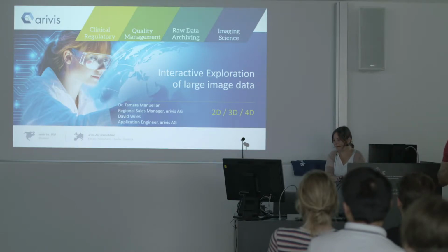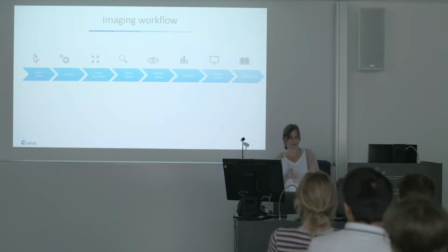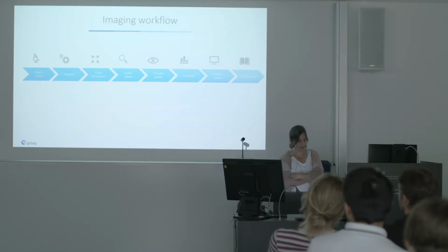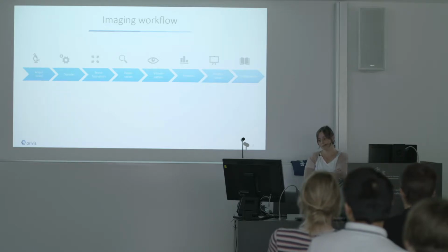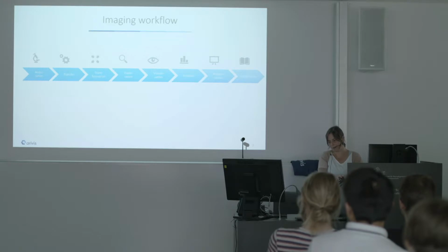Okay, so basically ARIVIS has been in the field for more than 10 years. And we have developed several software solutions which you will find in the typical imaging workflow.